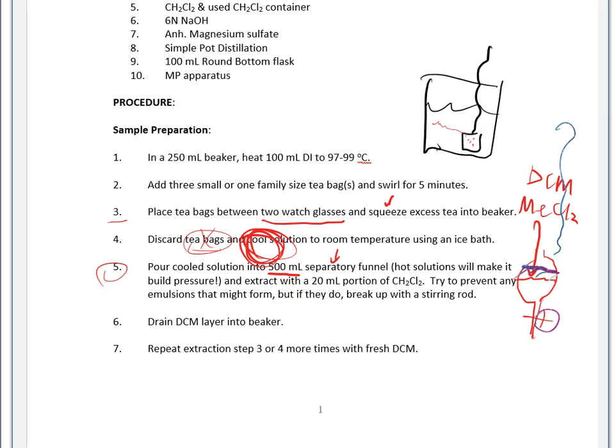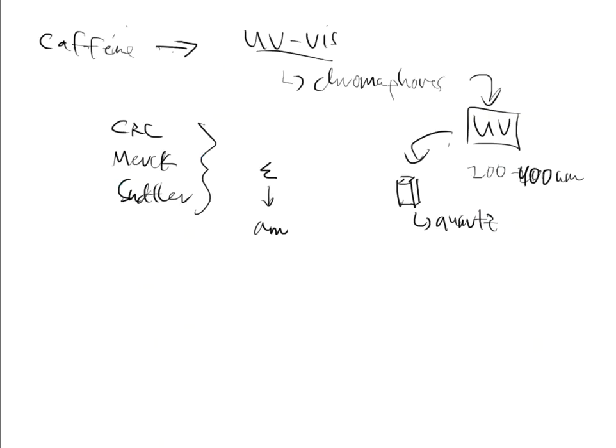All right, so the directions are going to say T-juice in the separatory funnel, and then 20 milliliters of methylene chloride gets added on the inside. You're going to treat this just like you do most separatory funnel extractions. You're just going to have to handle this a little more carefully, though. The reason is because you might set up an emulsion. An emulsion is a layer that has taken the aqueous and the organic, and it makes it kind of cloudy. It's like an interface layer where it doesn't give you a distinct layer of separation, and that's okay.